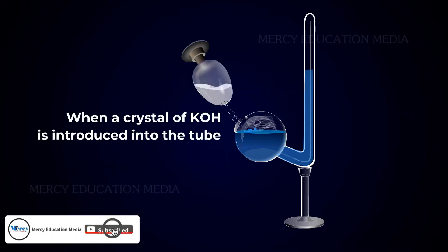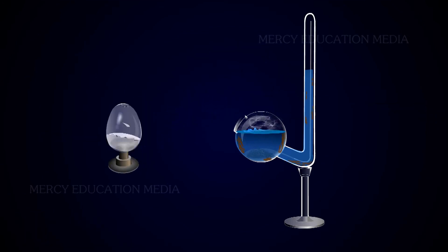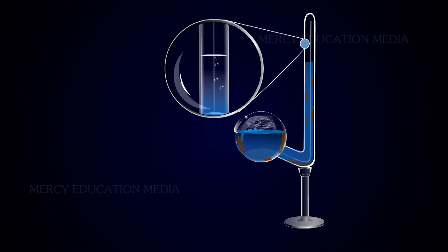When a crystal of potassium hydroxide is introduced into the tube, the potassium hydroxide will absorb the carbon dioxide and the level of the solution will rise in the upright tube.